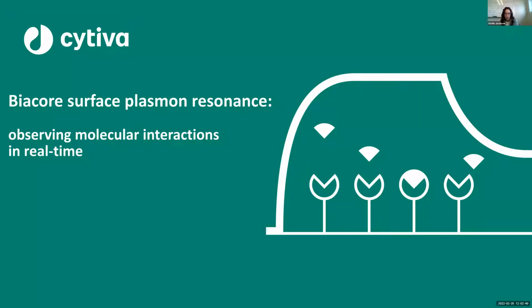Some of the instruments that I'd like to highlight that we're not going to be talking about in detail today include our JASCO circular dichroism spectrophotometer, which provides information on molecular structure and its changes for various chiral molecules. We also have a Beckman analytical ultracentrifuge, which measures macromolecular size and shape and studies interactions in solution as well. And then also a microcal isothermal titration calorimeter, which measures the affinity and enthalpy of interactions in solution.